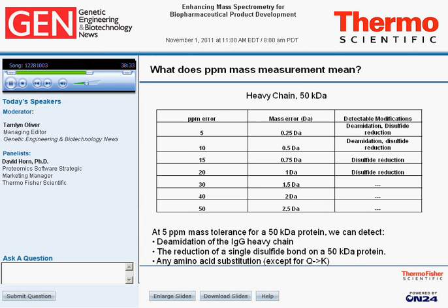If you have a significant amount of deamidation, that will show up. Any 1 disulfide reduction will clearly show up in the mass of that protein. And pretty much almost any amino acid substitution, except for maybe glutamine to lysine, will also show up. So if you detect that heavy chain with isotopic resolution and it matches the target mass of what it's supposed to be, that means you're very confident that what you have is correct, at least in terms of chemical formula. Next slide, please.